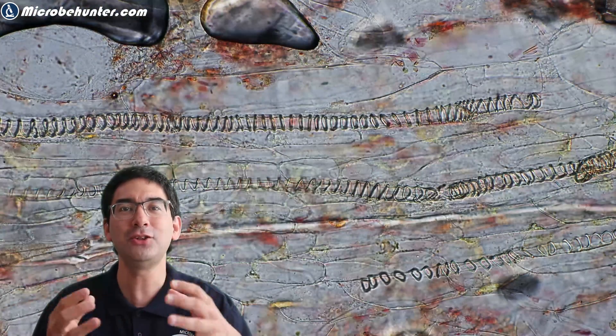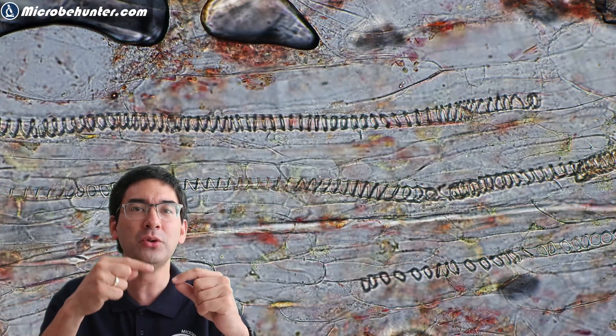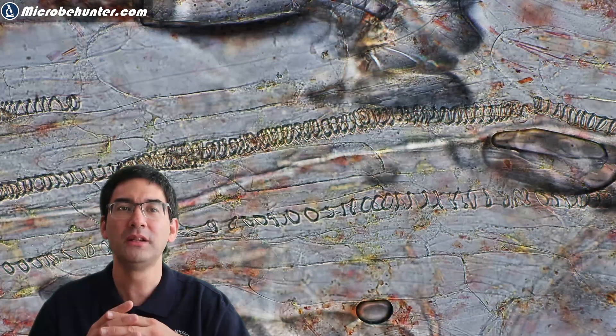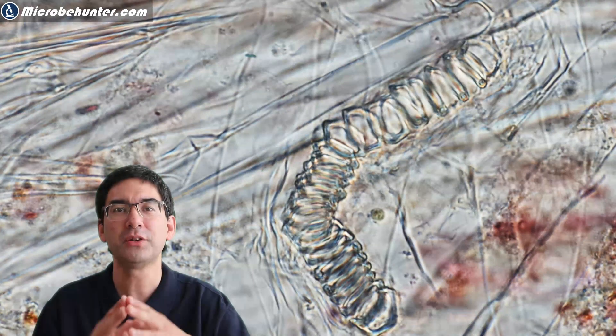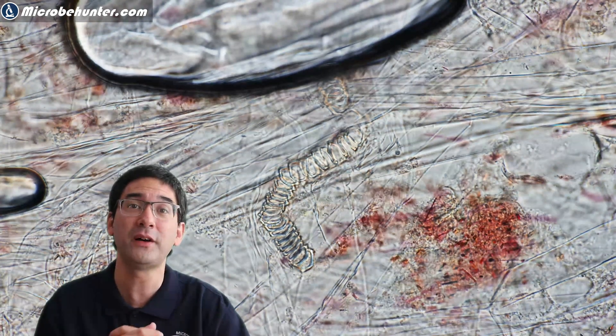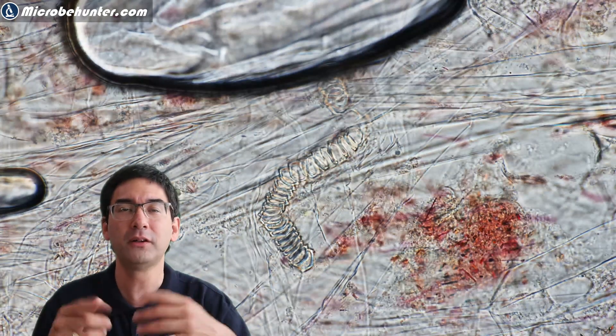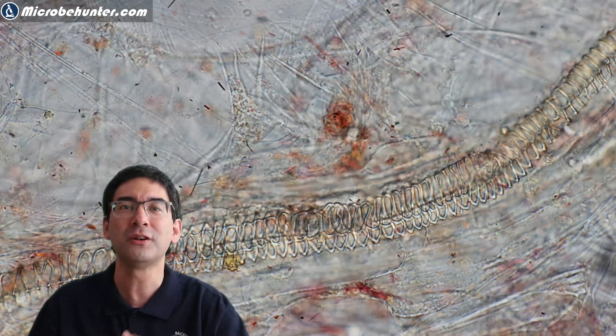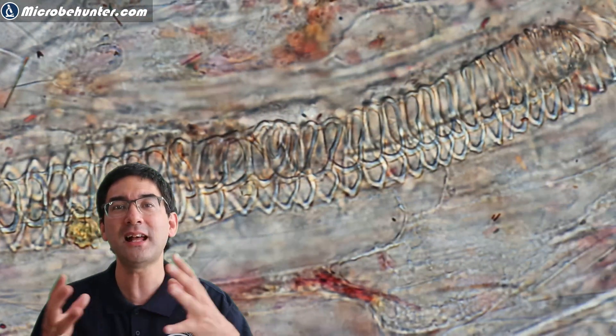You can see quite interesting spiral-shaped structures — that is xylem. Xylem tissue is the tissue of a plant that transports water, and in many cases it contains ring-shaped structures that strengthen the cells and provide support. You can find xylem not only in watermelons but also in other fruits like bananas. Different plants have different xylem shapes — sometimes spiral, sometimes individual rings. If you ever see those structures, you know these are the cells that transport water and provide support against the water pressure.